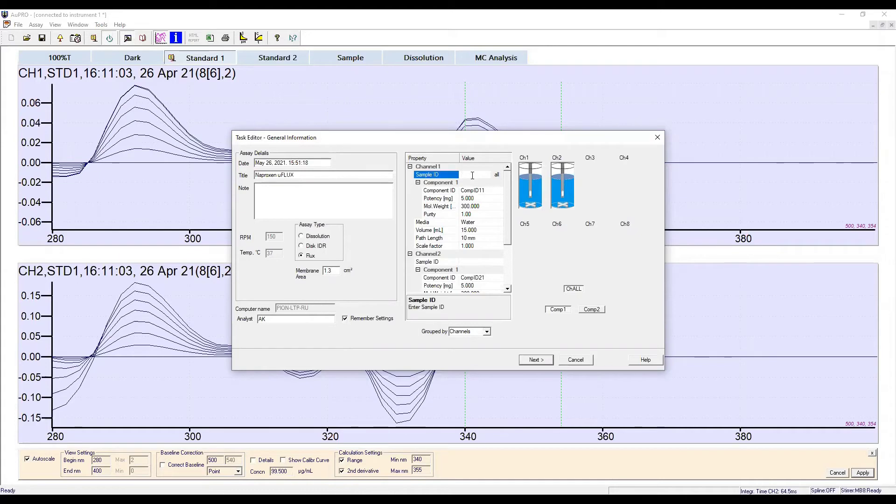On the right hand side, sample information is added. This includes the sample name, molecular weight, mass and chamber volume, as well as analytical details such as the path length of the UV probe.